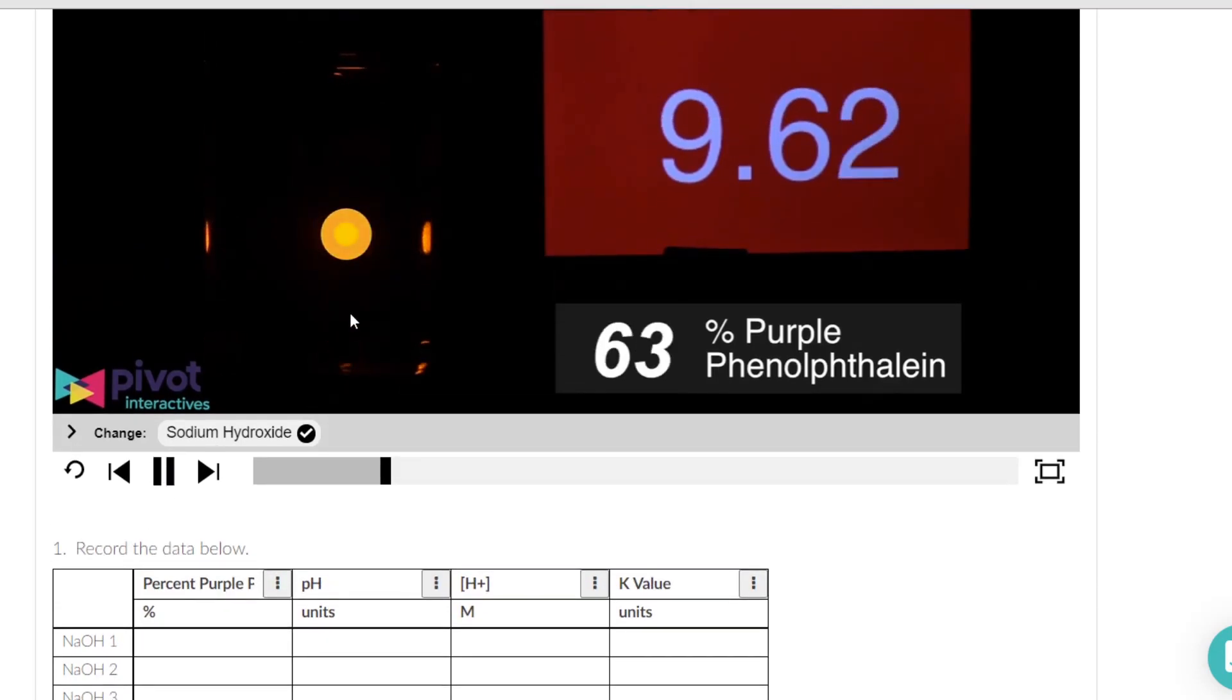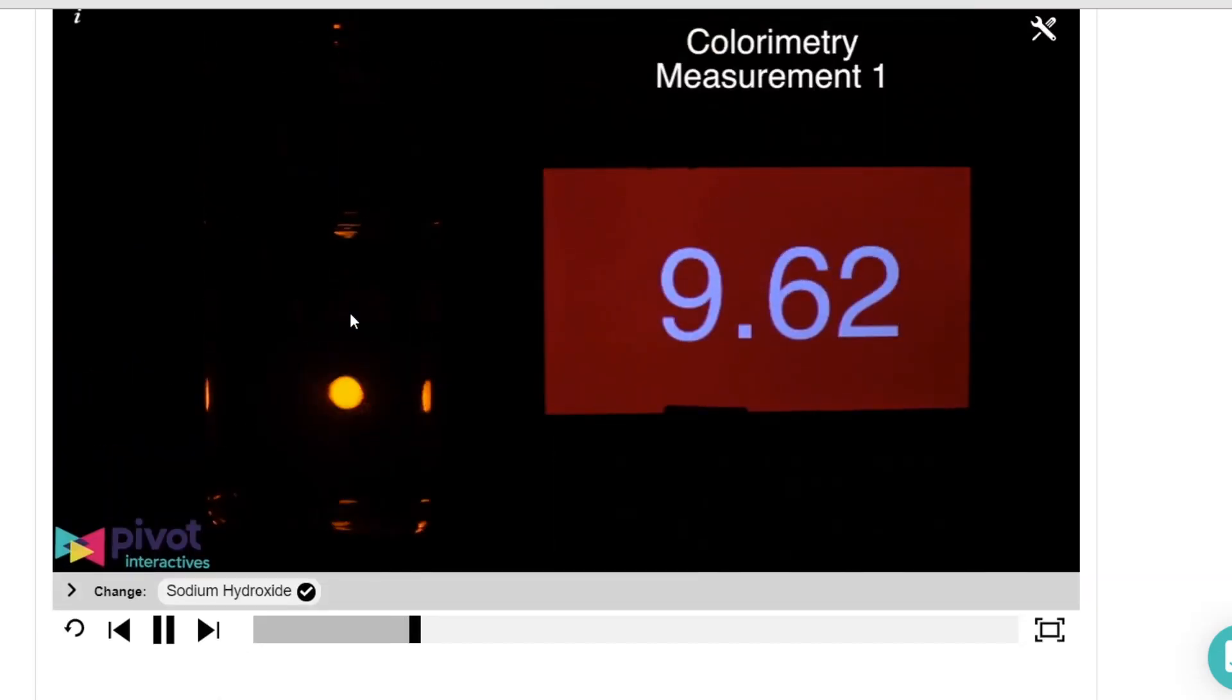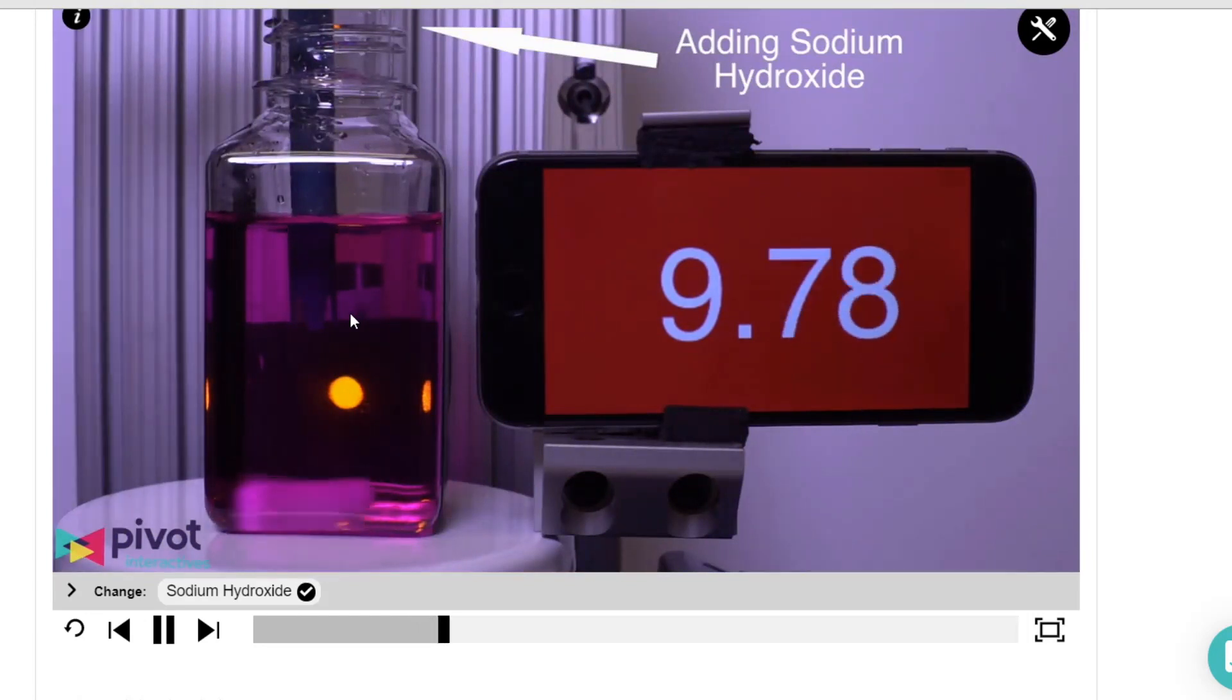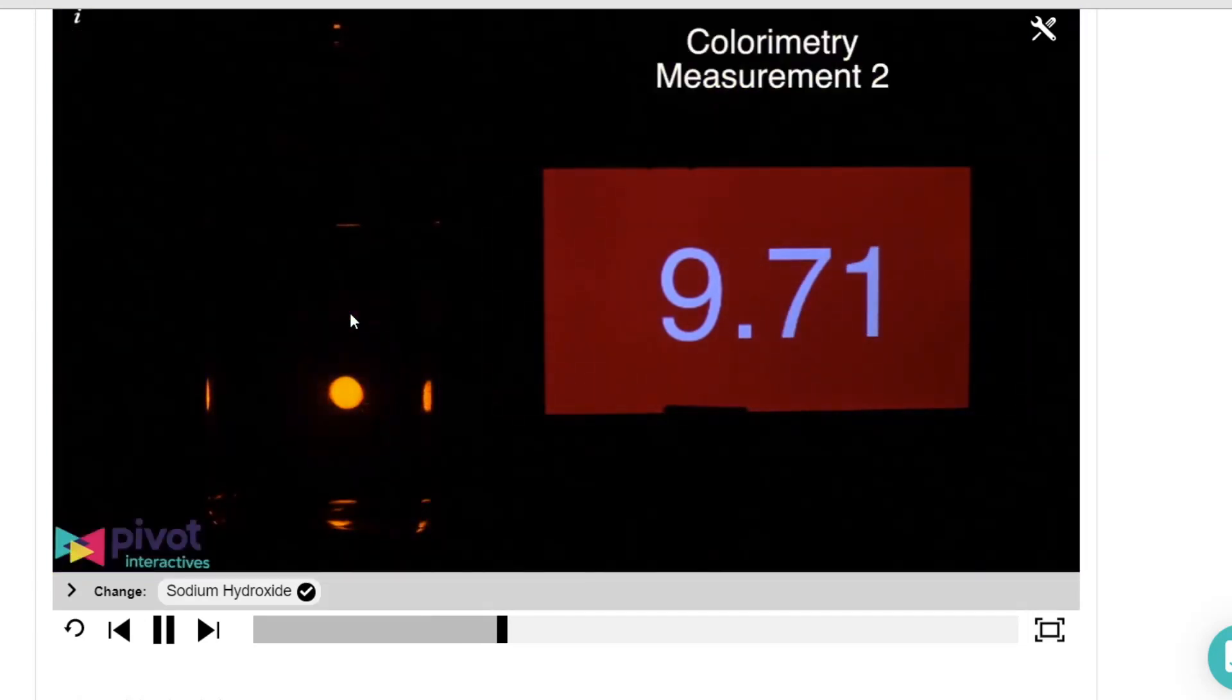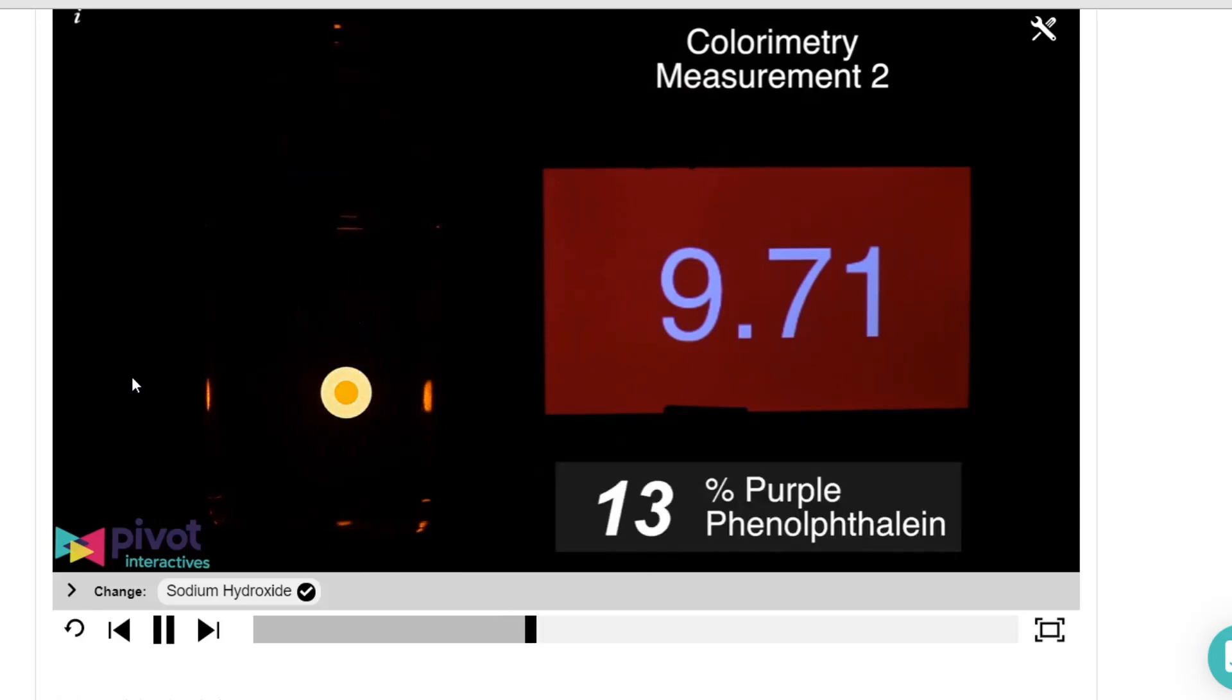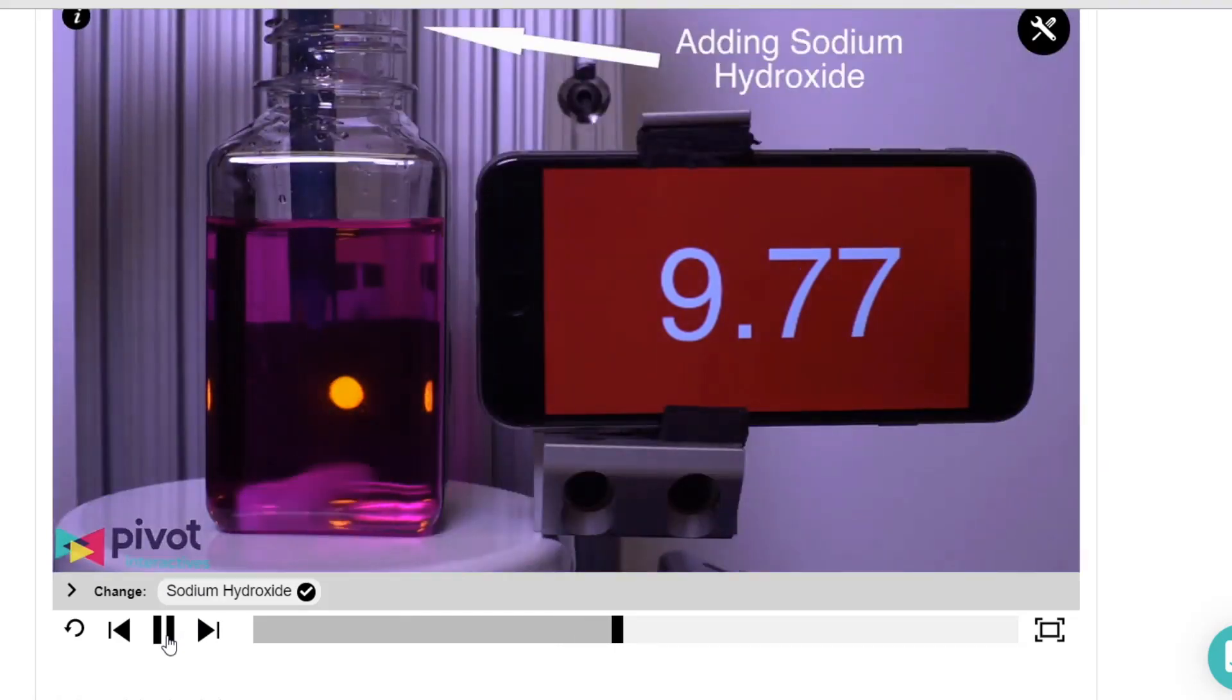As the video keeps going, they add some more. This time the pH changes some more. It goes dark, and again, you have to stop it when the colors are approximately the same. And this time 62% of it is left. So they'll take you through a couple different trials so that you can record the data.